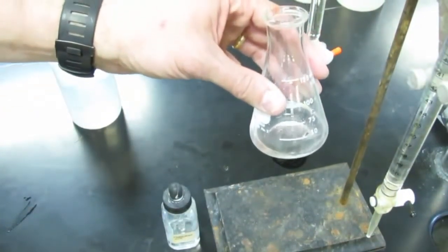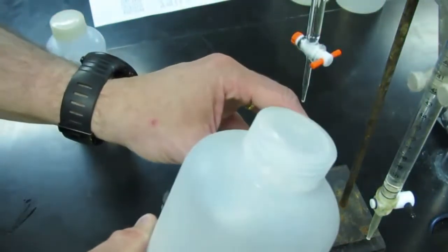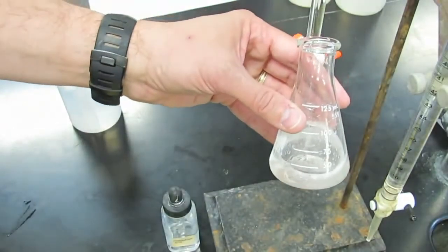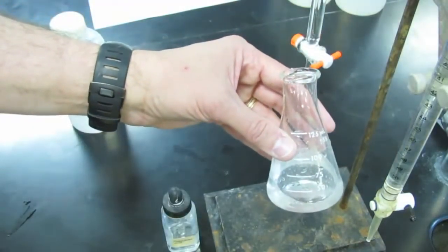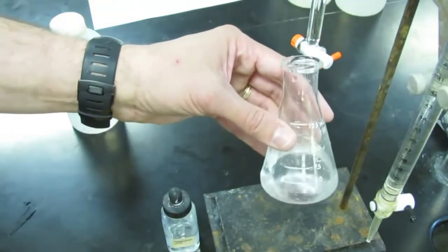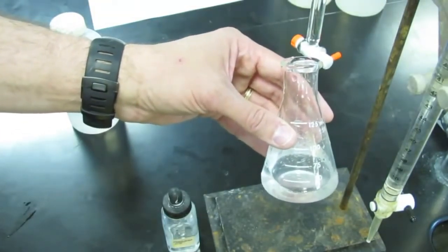Sort of hard to see that volume, so we're going to add some distilled water to this. Doesn't make a difference how much. Think about it. If I add distilled water to my acid, have I changed the amount of acid that's in there? No, I still have a certain volume of acid in there. I've just diluted it with a bit of water.